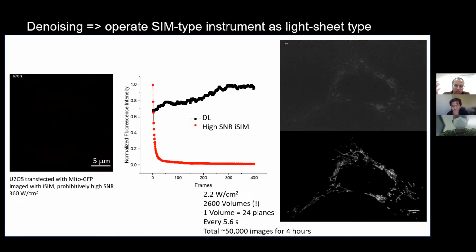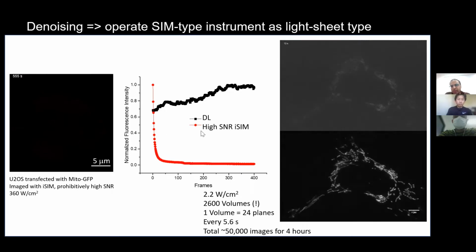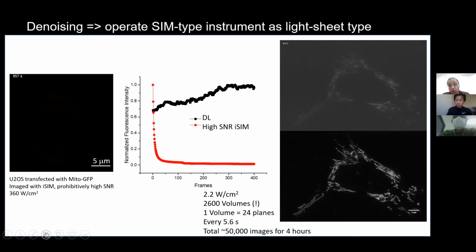One way of beating this trade-off, of course, is to turn the laser down. If you turn the laser down to the point where the rate of photobleaching is small compared to the rate of protein synthesis, that's amazing. You can image forever. The problem is that the signal-to-noise ratio is garbage and you can't make much use of those images. You can see that in the movie I'm playing now on the right: we can image for a very long time, but the images are pretty poor quality.